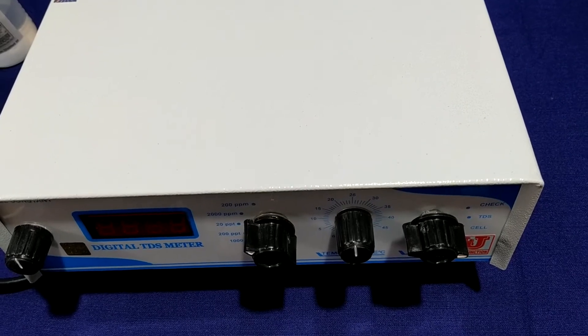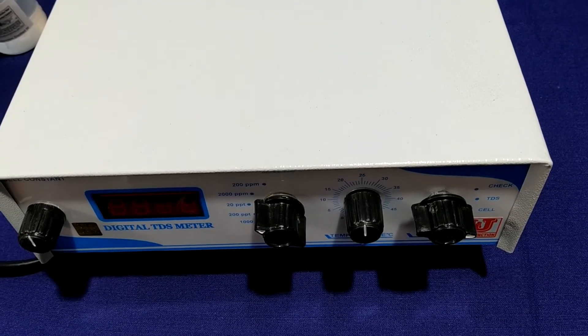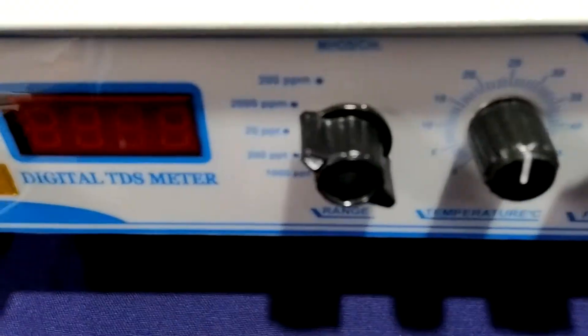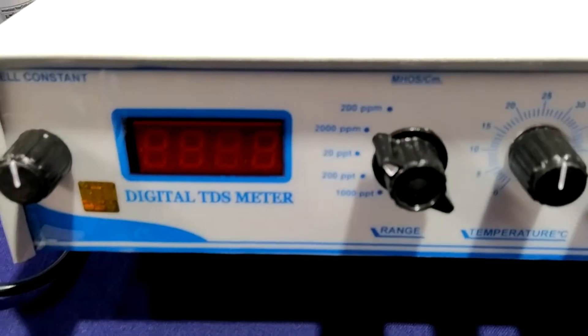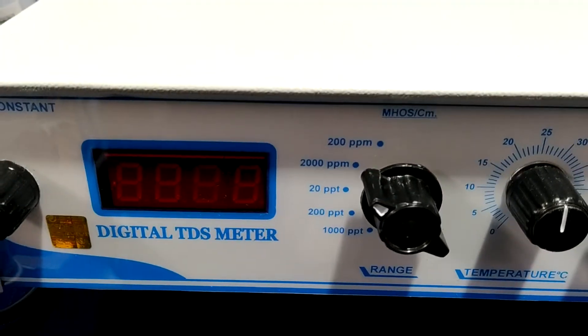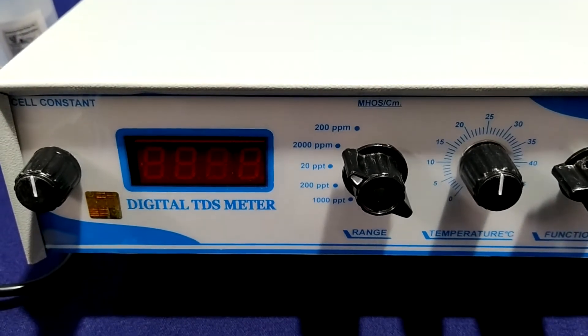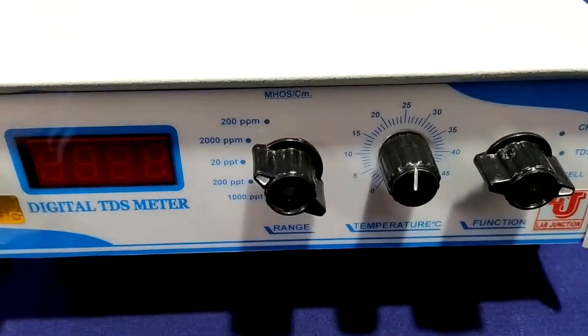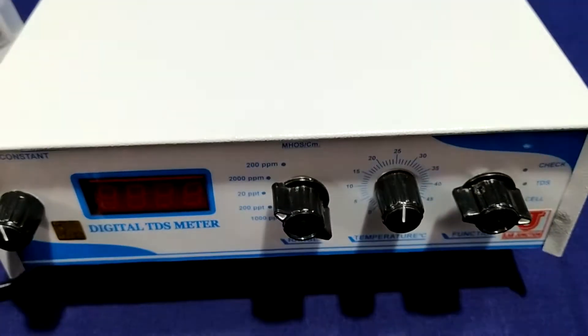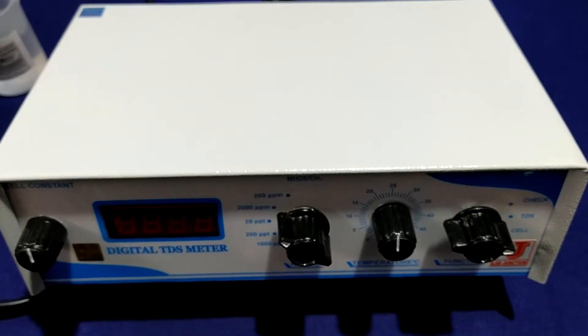Lab Junctions digital TDS meter. We have two models in the digital TDS meter: one is LJ651 and one is LJalpha05.